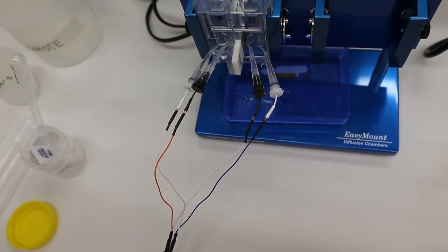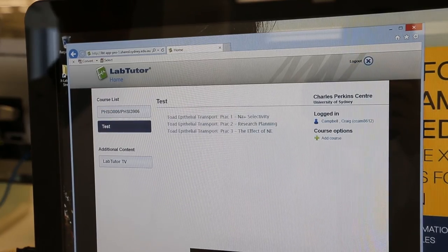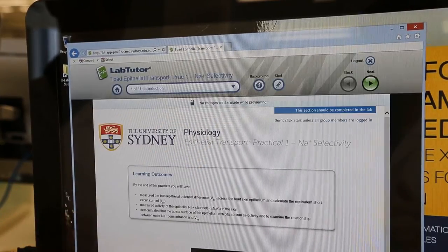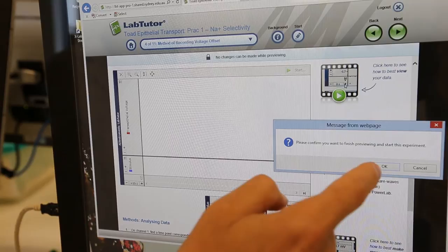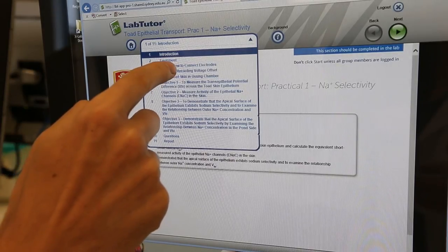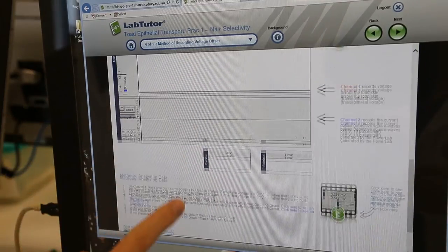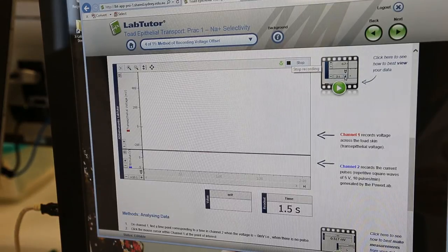Having wired your electrodes, if you are not already, log into Lab Tutor. Then select the Toad Epithelial Transport Prac 1. And once the software is started, press the Start button. And go to page 4. On page 4, you will find a chart window. In the top right-hand corner, press Start. This will begin the trace.